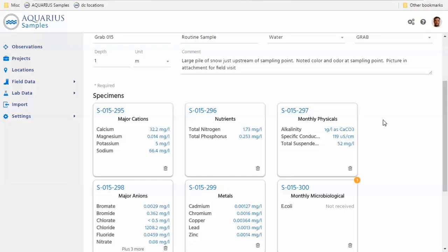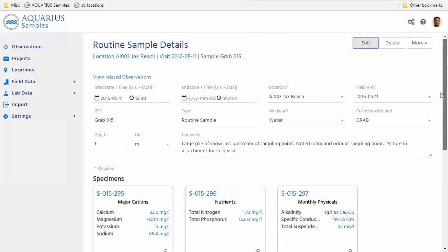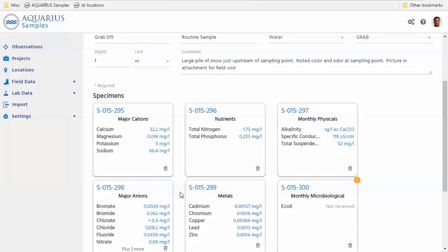I think it's important to emphasize this point as well, Max, and I'll just take a second to do it. One of the issues that we get from customers often is that in the cases where they deal with multiple labs, they often have a hard time tracking in one system where different things are. And as far as I understand, these bottles could all be targeted at different labs. Is that right? Exactly. So we separated two concepts: tracking your fieldwork, which data is one sample, what belongs together, and the individual containers that could be sent to different laboratories for analysis. They might have different preservatives, different filtration. So those two things are combined in one.